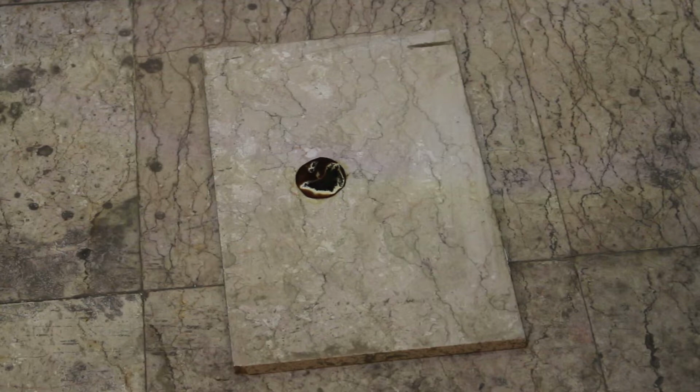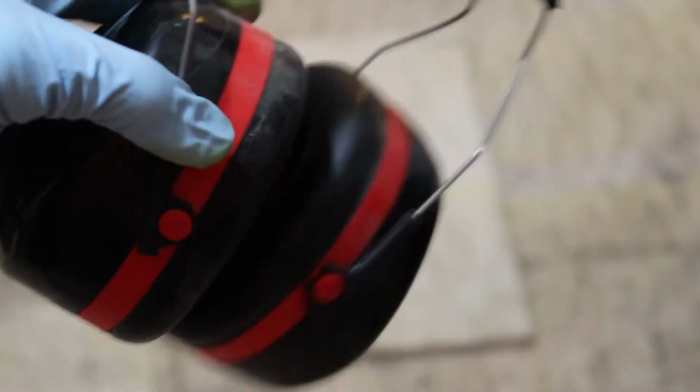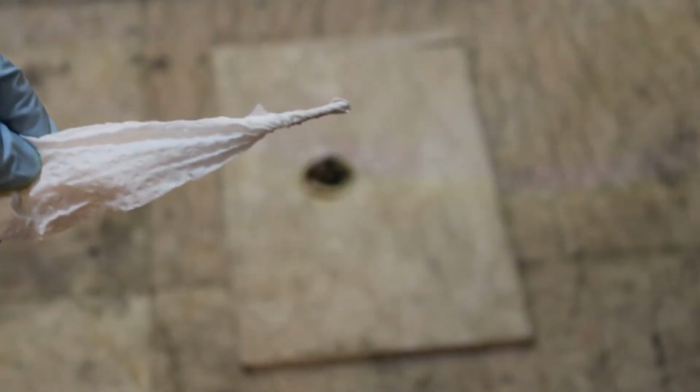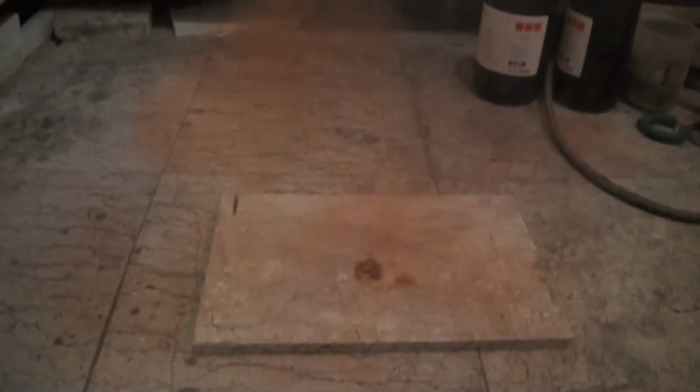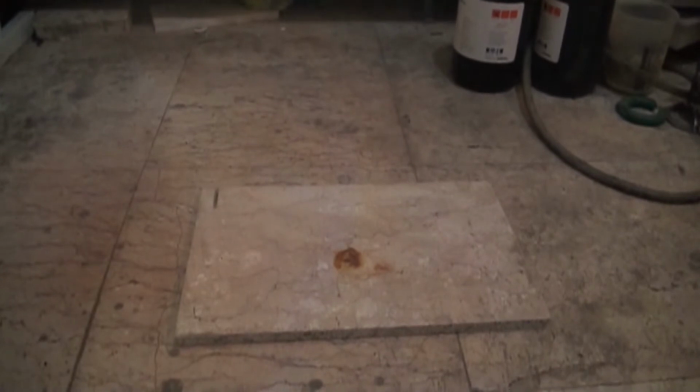Before the explosion, I seriously recommend putting on noise-reducing earmuffs and safety glasses. As you can see, it explodes with the slightest contact. During the reaction, I2 is released as a purple gas and N2 is released as an invisible gas. But why did this happen?